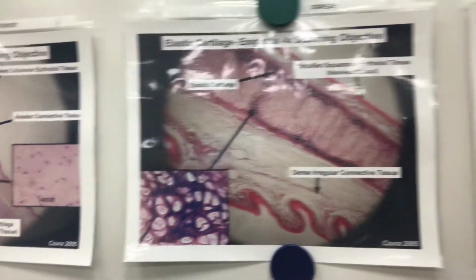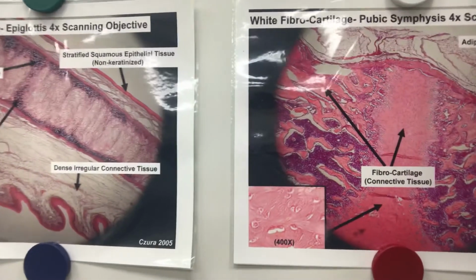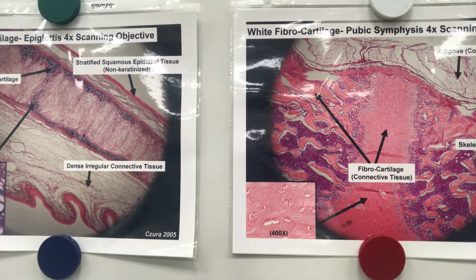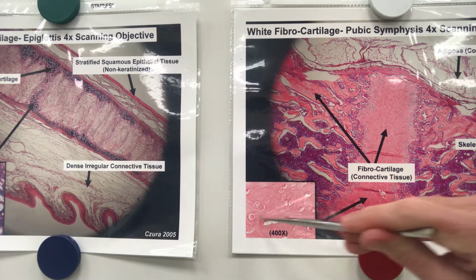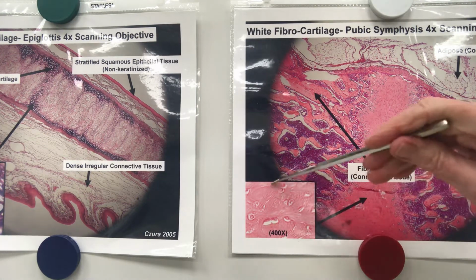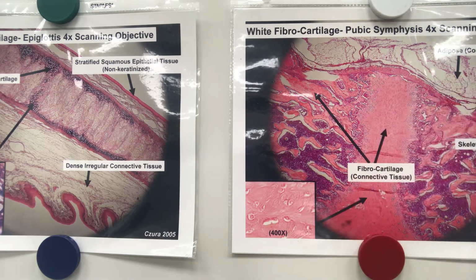And the third type of cartilage we have is called fibrocartilage. In this case, it's going to be extremely fibrous. Now here you can see the cells, and I think the material in between the matrix looks almost like cement. It looks very grainy and fibrous.